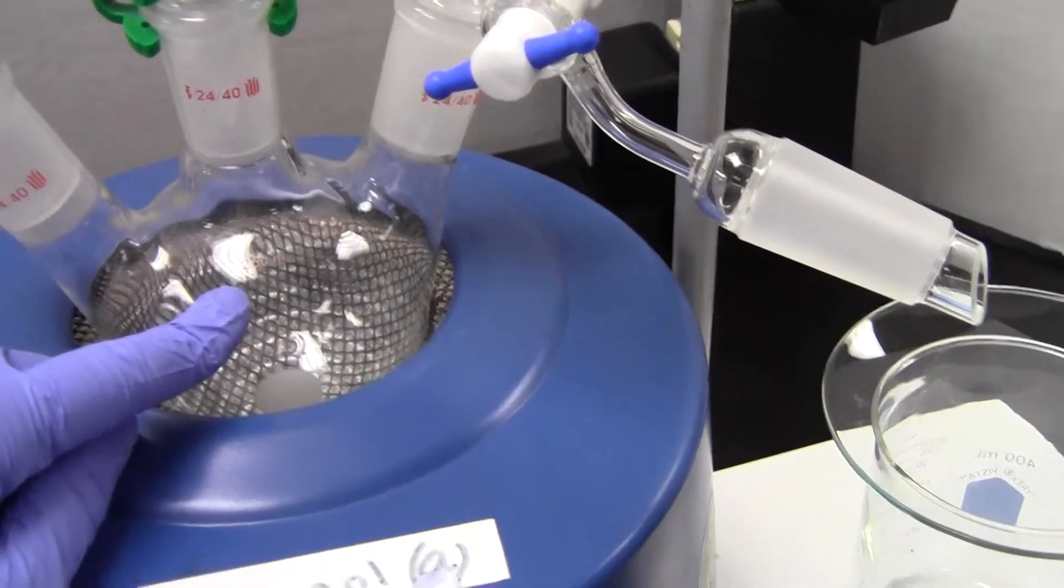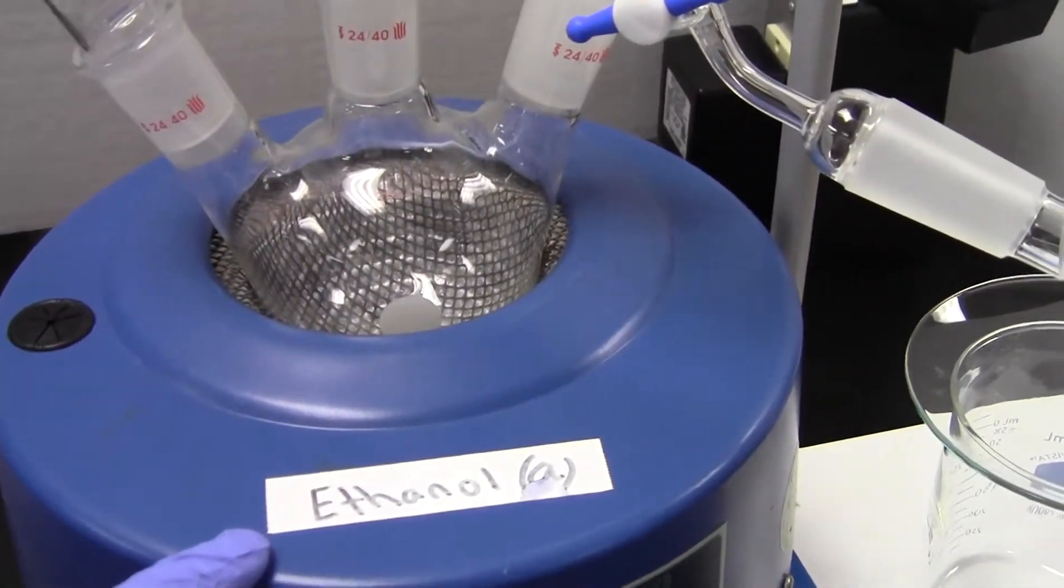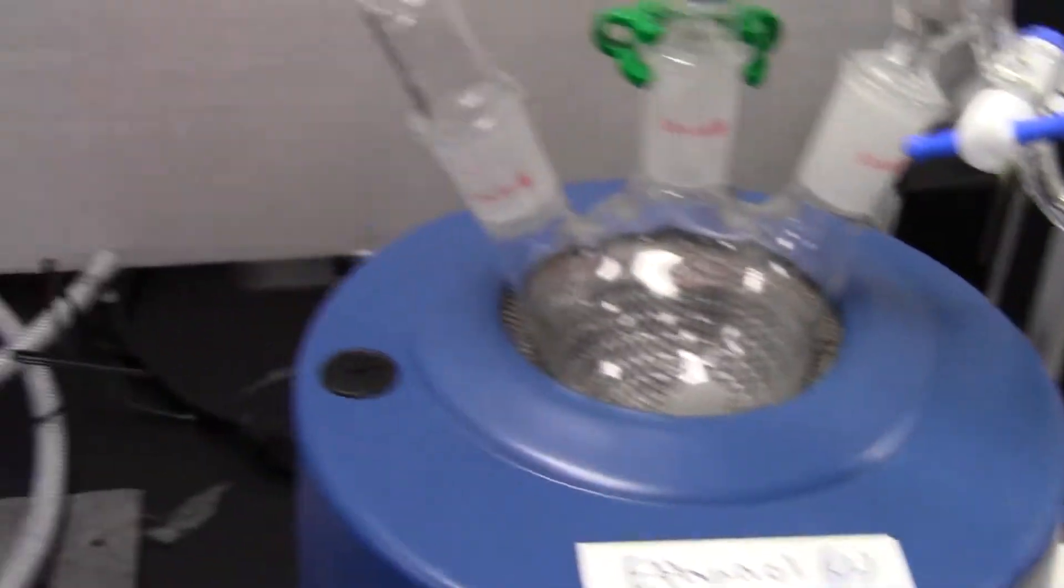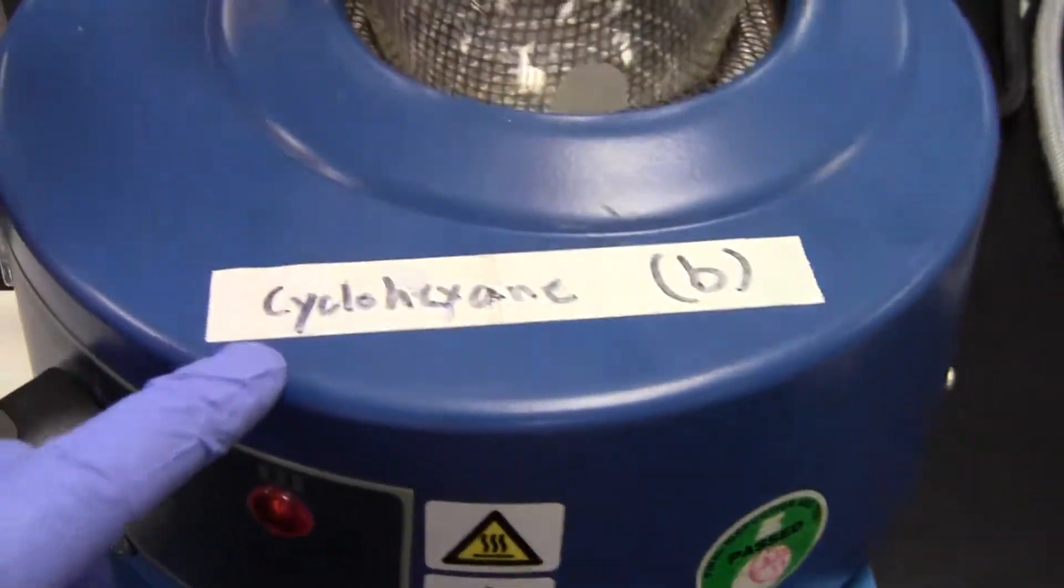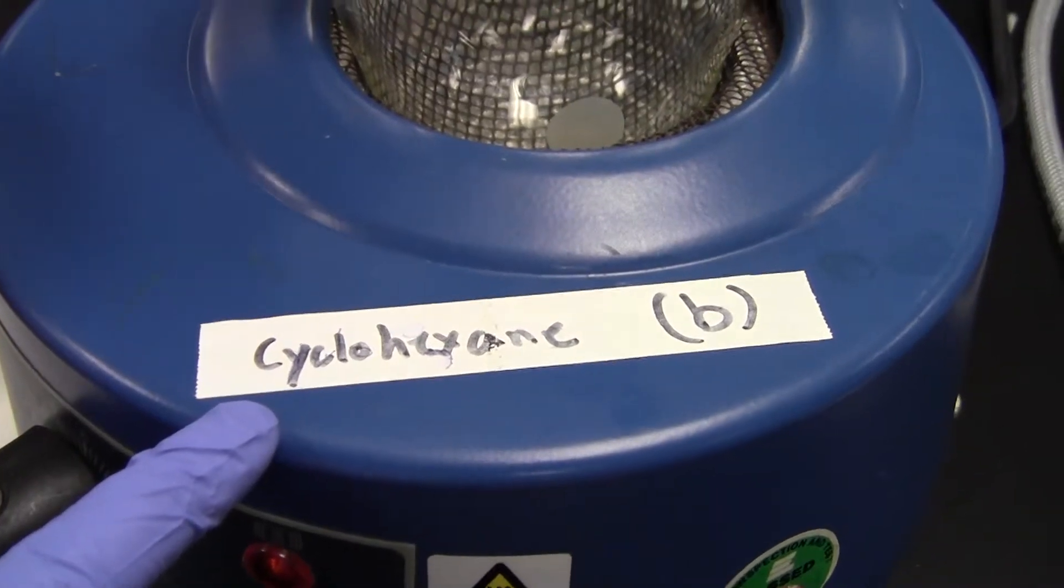Introduce the first liquid, ethanol, into the flask. If you're doing this lab a second time, we have another identical setup where you would be using cyclohexane as your first liquid and adding ethanol to that.